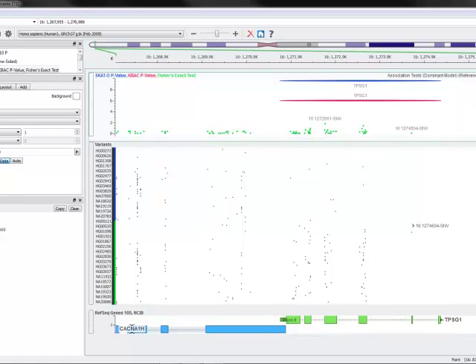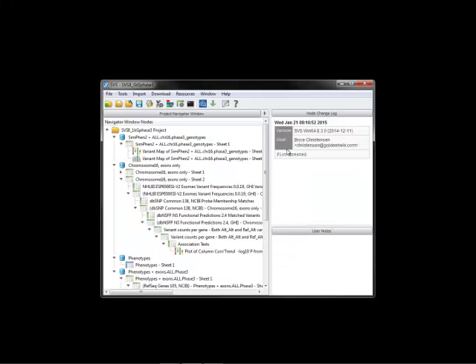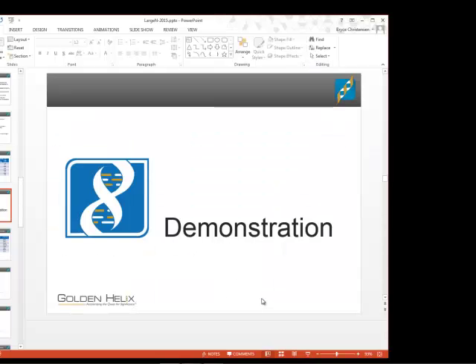So with that, I think we can go ahead and close out of SVS for a little bit and go back to the slides and talk about what comes next.